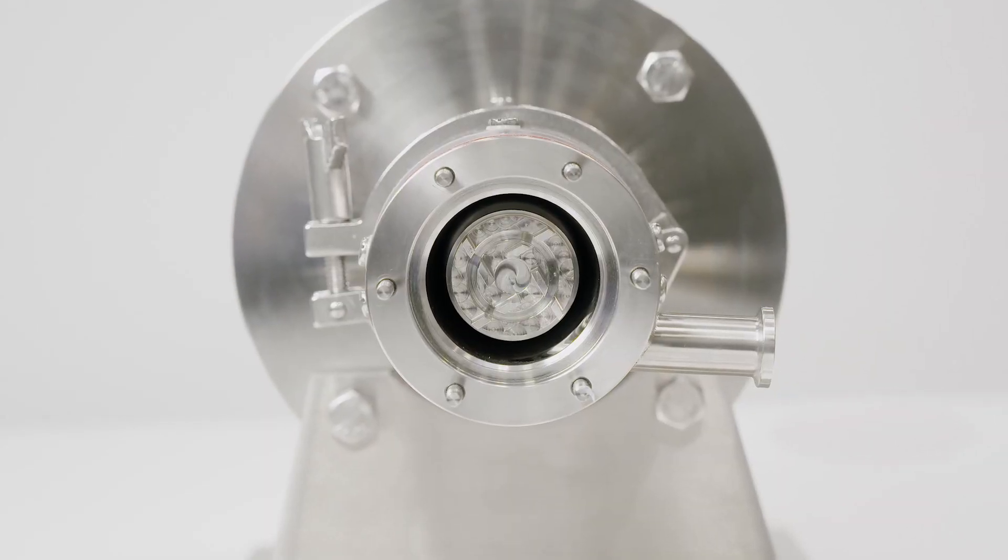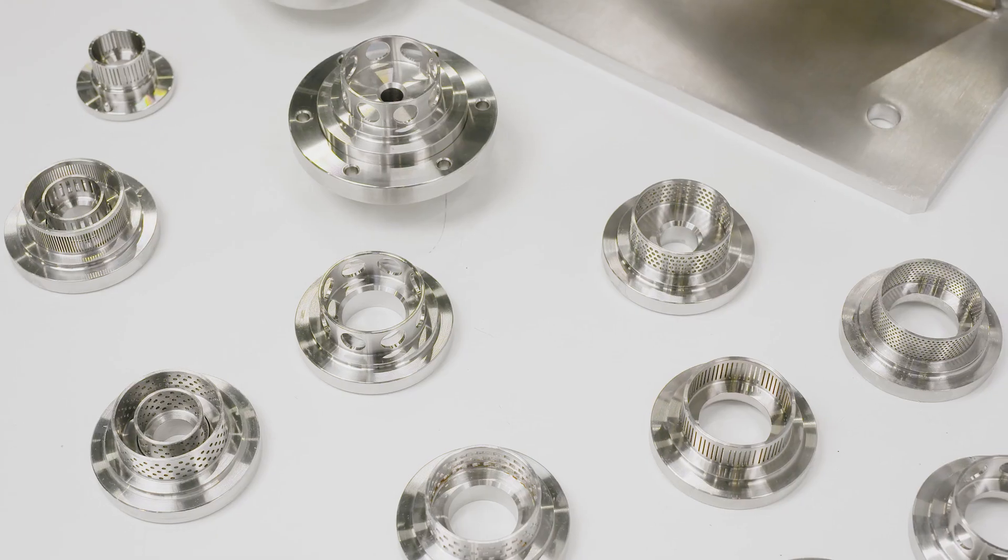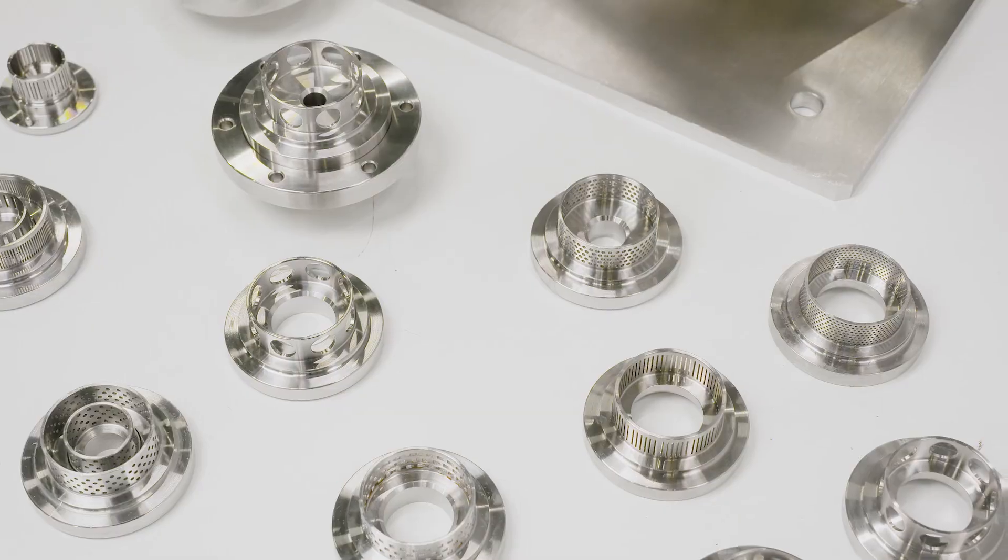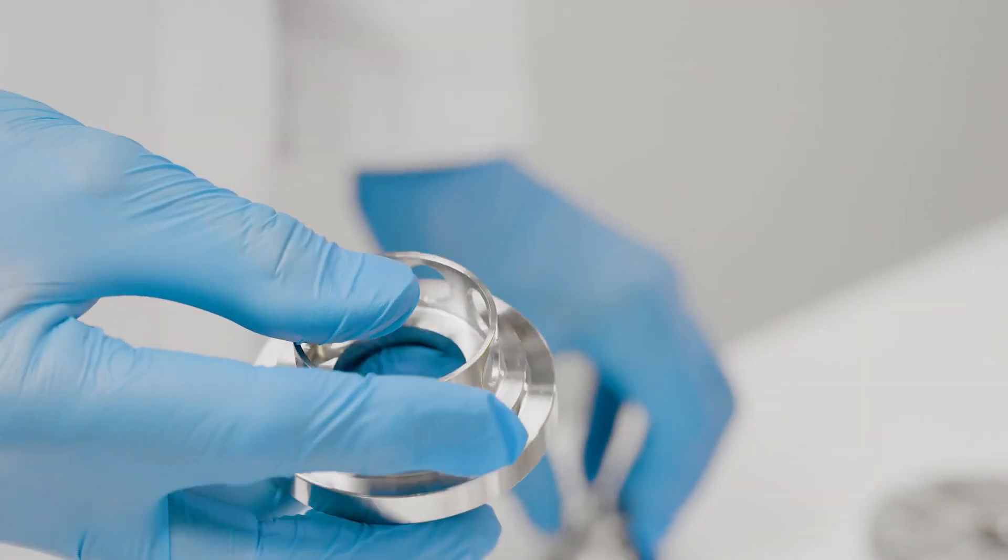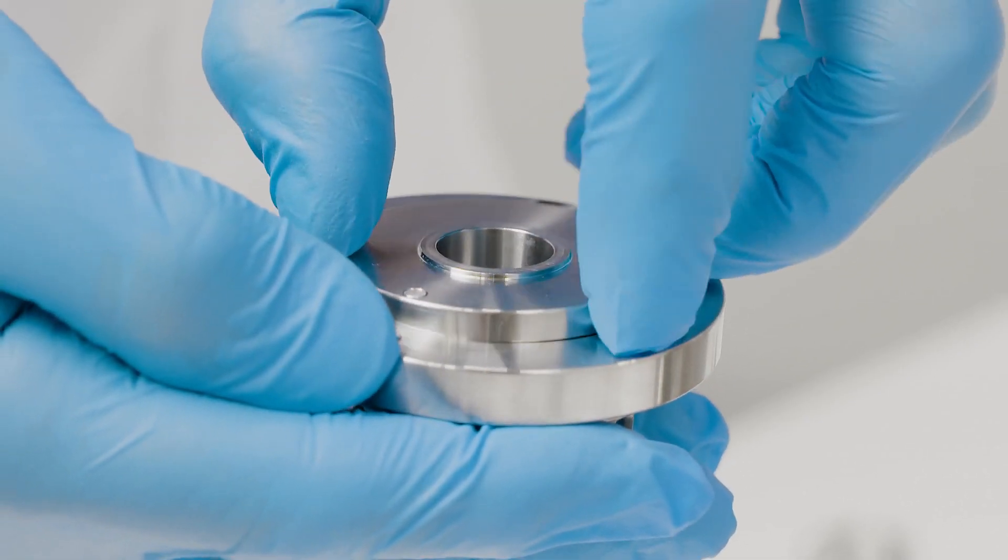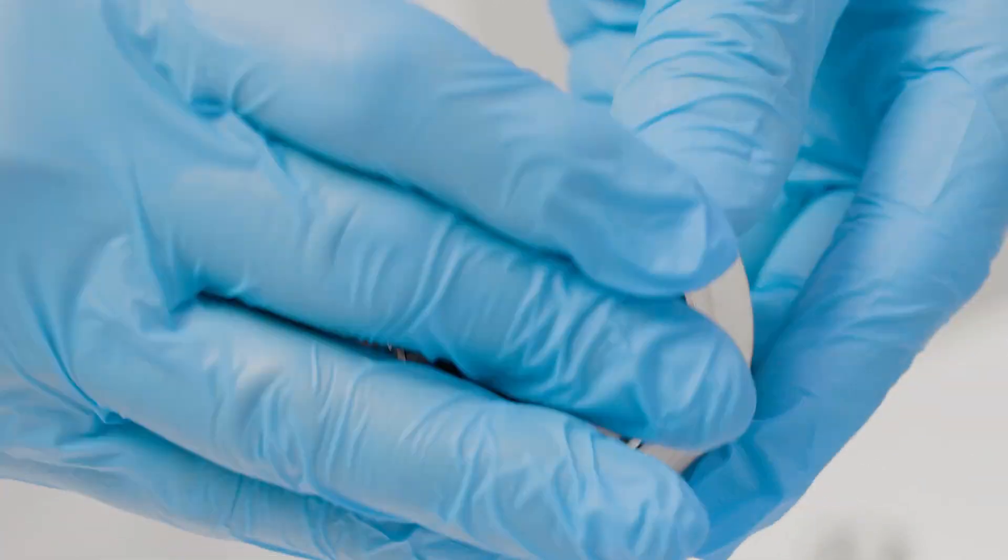The multi-stage workhead substantially increases the number of shearing actions per revolution of the rotor, resulting in faster mixing times and increasing the number of products that can be processed in a single pass.